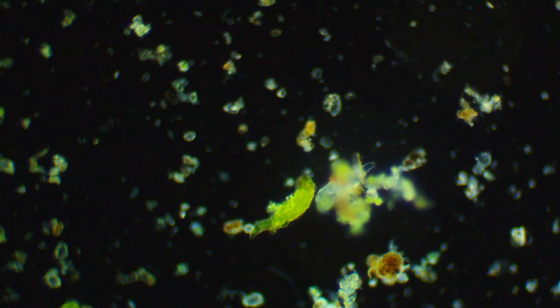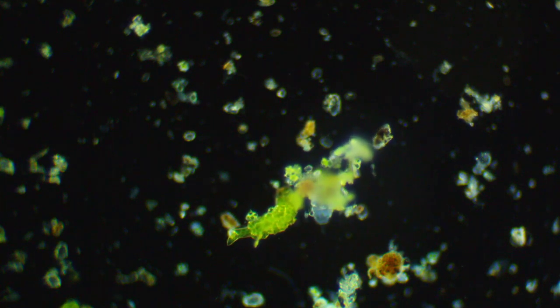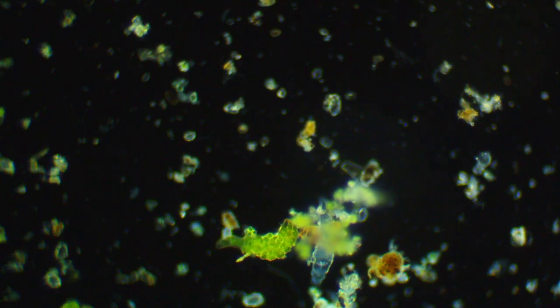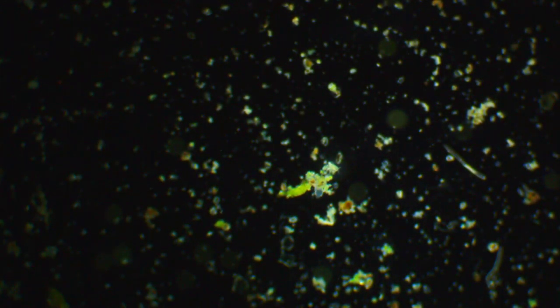He found another big chunk of moss there. You gonna collect that too, dude? He's slow, so I'm going back out. I haven't even looked at this entire drop yet. Looking at these rotifers, I'm still near the top of the drop.